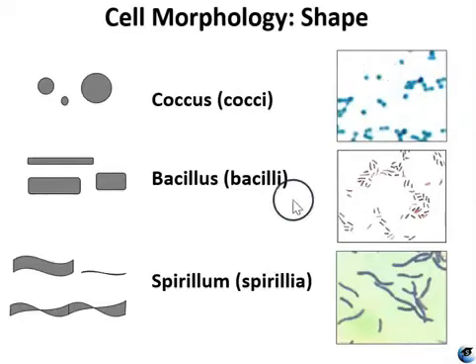In order for something to be classified as bacilli, in general, bacilli are rod-shaped, but they can look quite different. They can be kind of long and skinny rods. They can be a little short, squat-looking rods. And these, a lot of the time, are misidentified as cocci, so you want to be really careful. But a whole lot of bacilli are right in the middle. They're not super thick or thin. They're not super short or long. They're kind of pill-shaped like these guys.